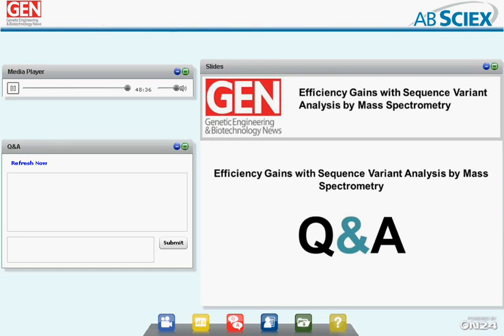Okay, and Eric, we have a question for you. It's a little complex, so bear with me. You may be aware of this introduction to protein pilot data analysis. It's University of Minnesota. I'm not quite sure what the question here says. It's a database search program, protein pilot. I guess this person is looking for some comment on that program, if you know that. It looks like they're suggesting an academic review of protein pilot. I guess all I can say is thank you for pointing that out to me, and I'll take a look at it.